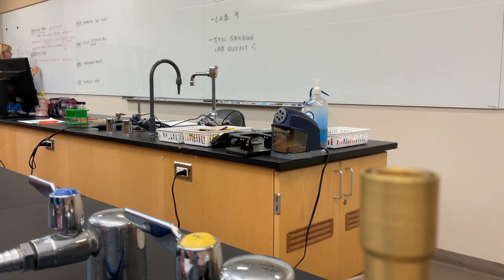These similar organisms could have the similarity of being all gram-negatives or all gram-positives or even the same genus. For example, we're going to work with some media today that is going to separate out Staphylococcus aureus from Staphylococcus epidermidis. And we're going to see a visual difference between the two.